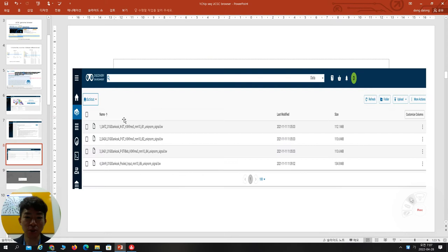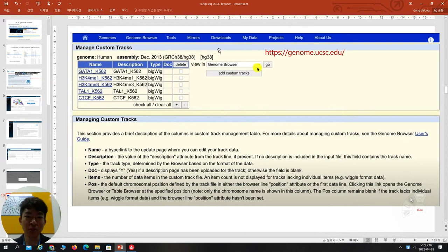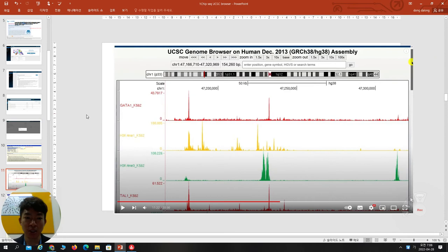After uploading, you can find a public link. When you click on a file, it shows certain rows, and from there you can find the public link. After copying this public link, go back to the UCSC Genome Browser, click 'My Data,' then 'Custom Track,' paste your data, and submit. I will show you this in detail one by one later.